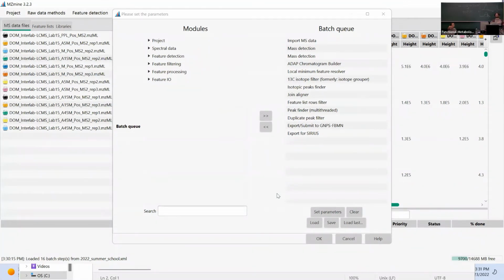It's all run on Orbitrap instruments, some lower end, some higher end, and the resolution is a bit different and so on. But those differences are actually what we want to test with the interlab study, right? We want to see if they have problems with sensitivity, retention time shift, or the quality of the MS2 data. So who's doing well?